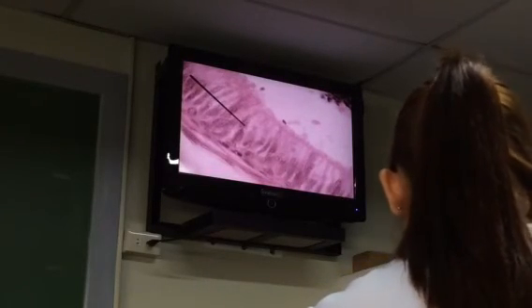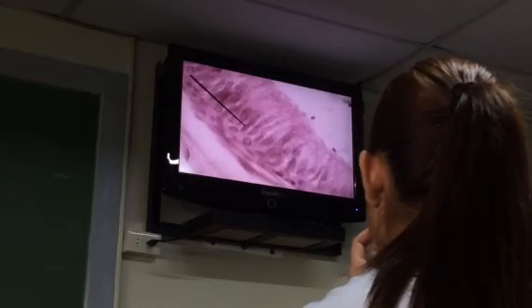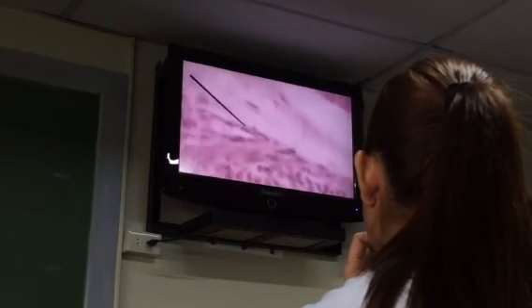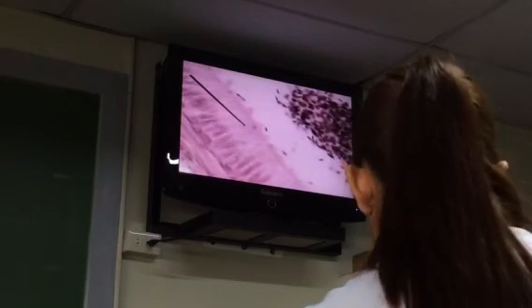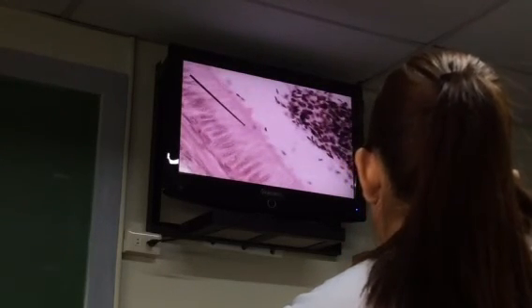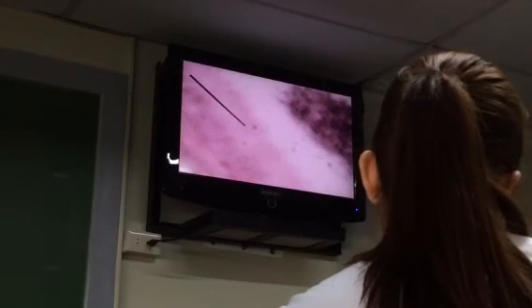Now, it's difficult to actually identify your halo cell in the light microscope. Okay? And then, of course, again, another epididymal tubule. Alright? So this is slide 67. So 66 is testis, 67 is the epididymis.